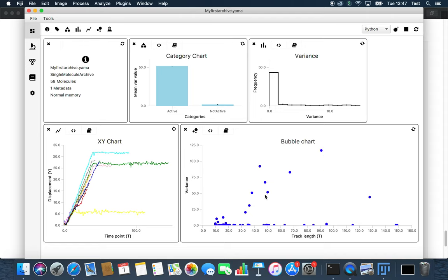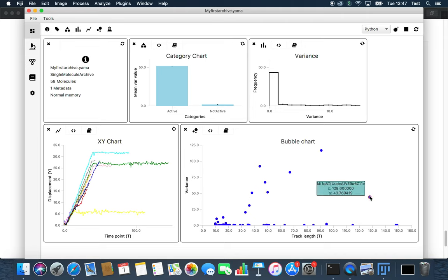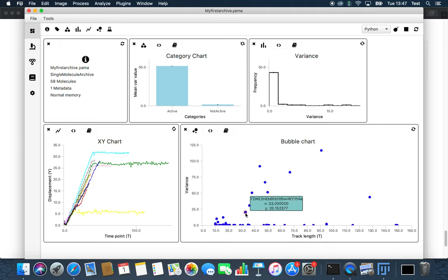You can hover over the dots to see the UIDs of the molecules. This is also great to spot outliers.